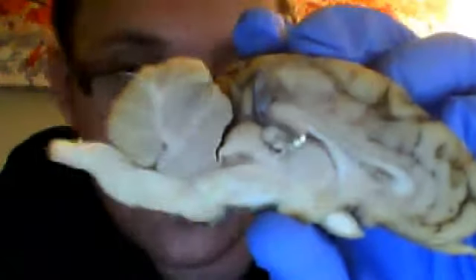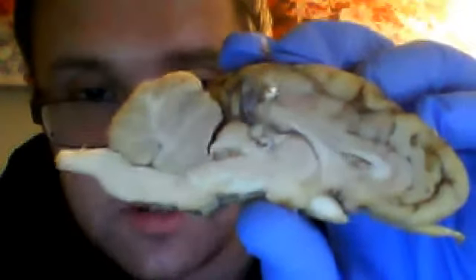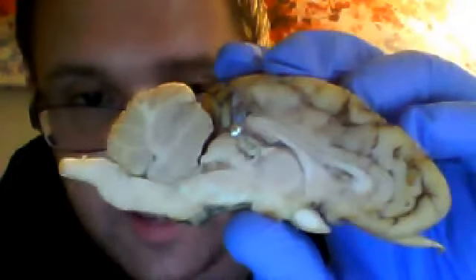Now, aside from those, there is the pineal body, which is located just anterior to the superior and inferior colliculi. And it's this structure right here that I have my pen in, see? That is the pineal body.